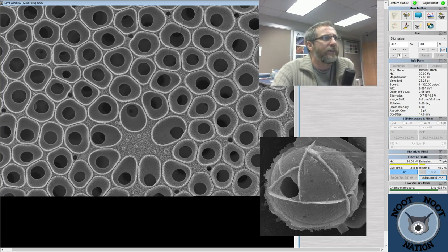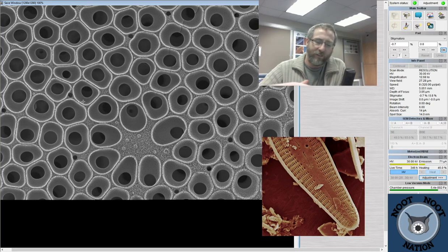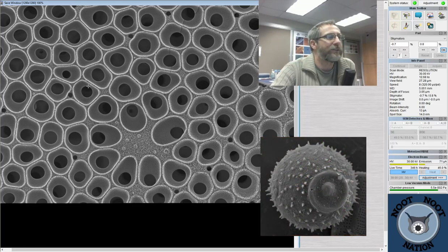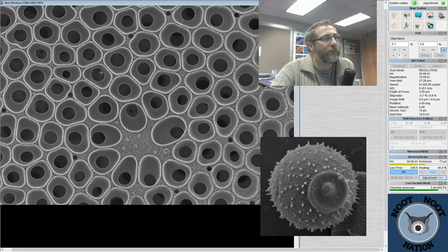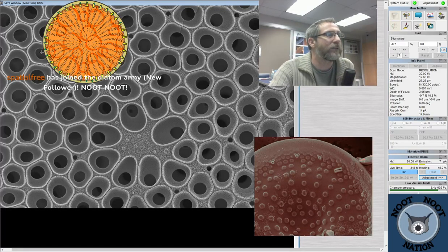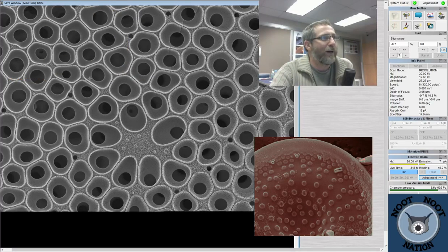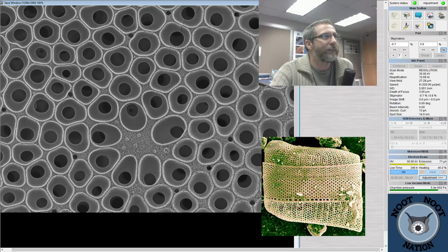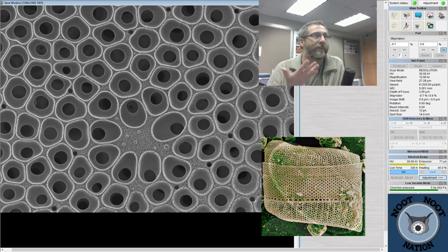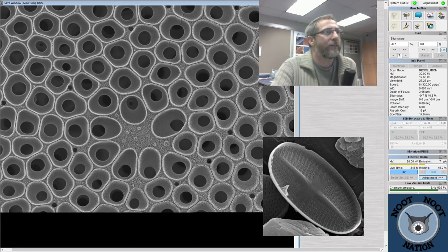Now this diatom is, I think, a Coccinodiscus, and they have sort of two layers. They have an under layer and an outer layer, and the areoli that you're seeing here are little chamber-like structures called loculate areoli. So they have a hole, then a chamber, and then on the other side there's another little hole. In some of them you can actually see that other little hole, but then there's a hexagonal or polygonal shape that's mapped out as a thick rib, like a honeycomb, right? Very much like a honeycomb, actually, that's on the valve face that stands up at us. And those are dividing walls between these structures in the loculate areoli.